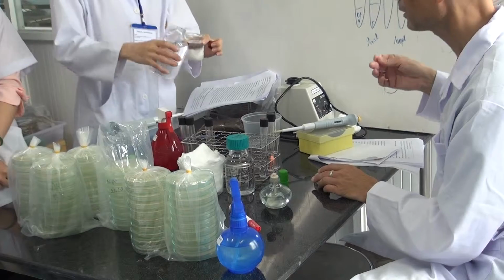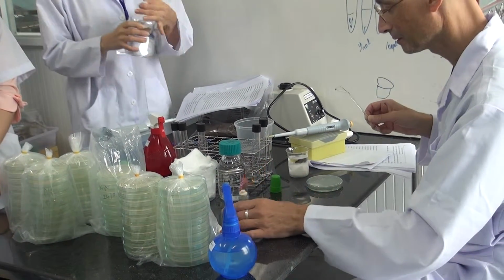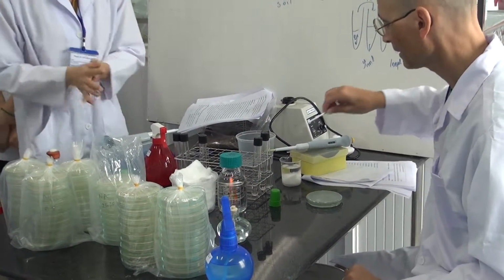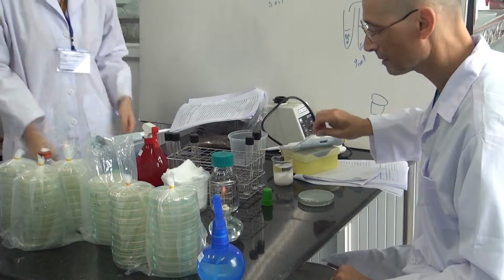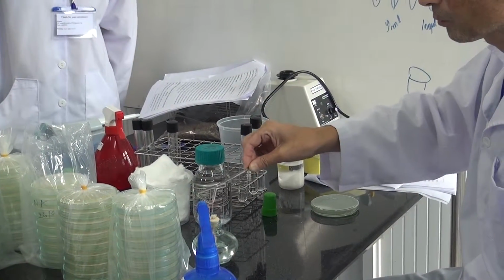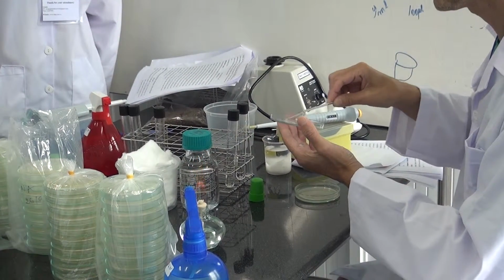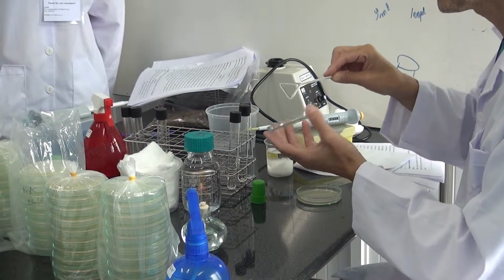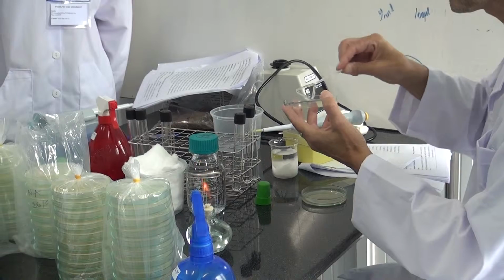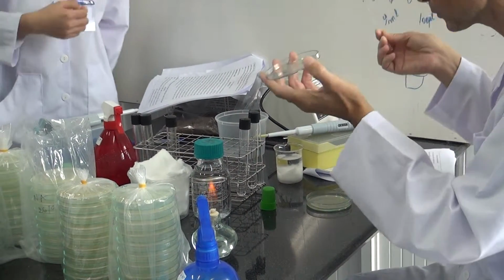Great. Now you have to be very, very, very careful because this and this, they are too friendly. Just take that slightly, go like this. So it's warm, it kills the bacteria. Then you cool it. So you cool it here. Okay, this is still wet. Sometimes this can be problematic because you add water to this. It's better if this is dry, but it's okay.